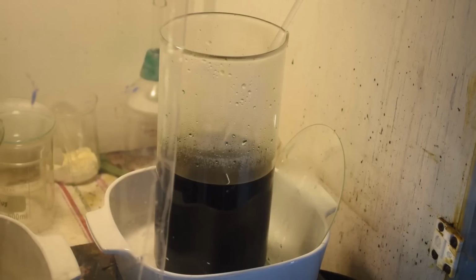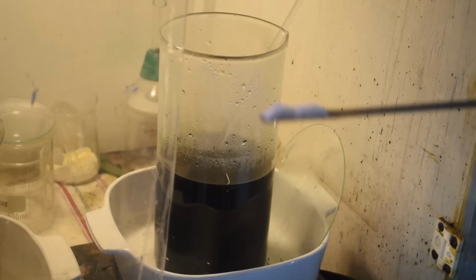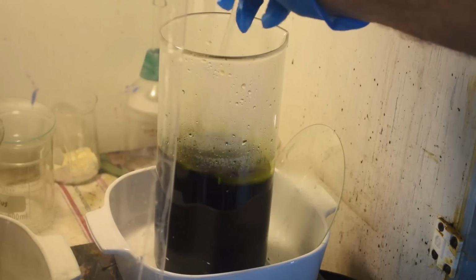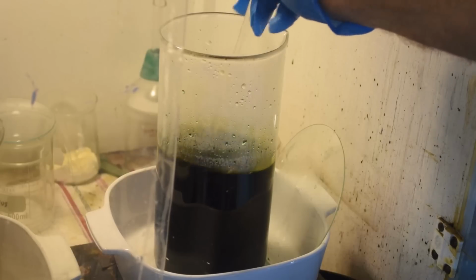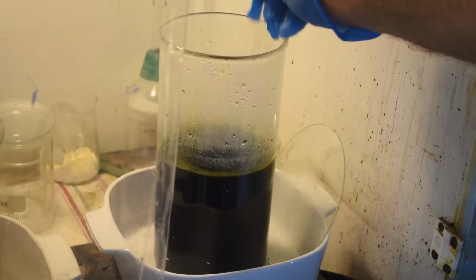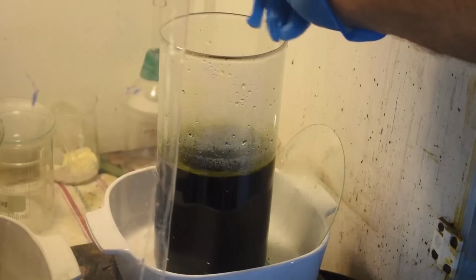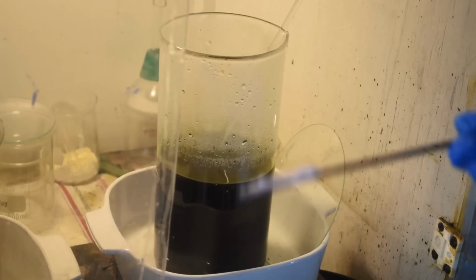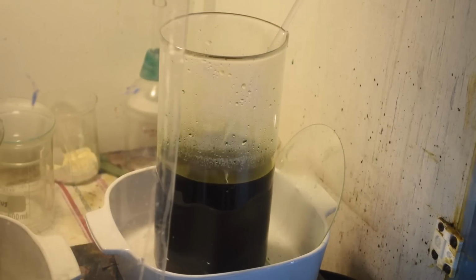All right, here's the last one. I hope you can hear me over the rain. It's starting to come down pretty hard. But this is the last one. I just got to drop the palladium out of it, and then there's nothing left to do but filter all this stuff. And filtration, the rest of it might have to wait until another day.